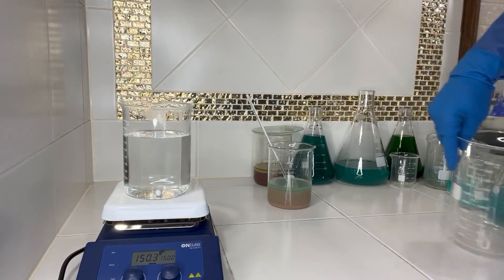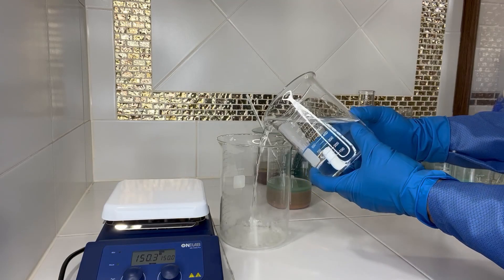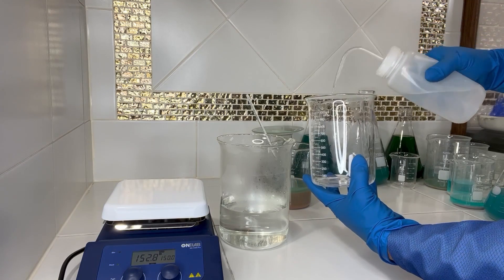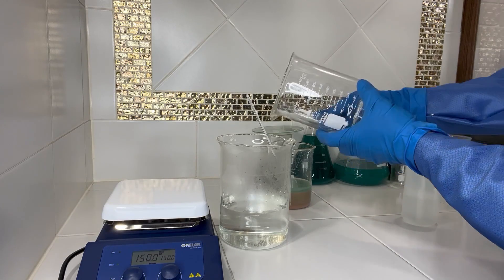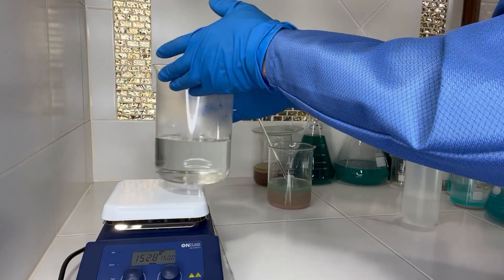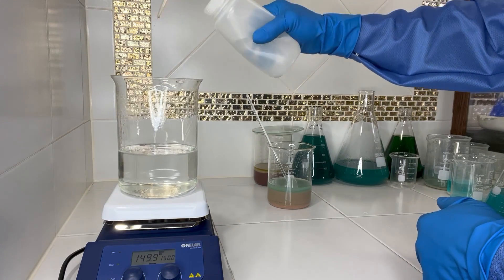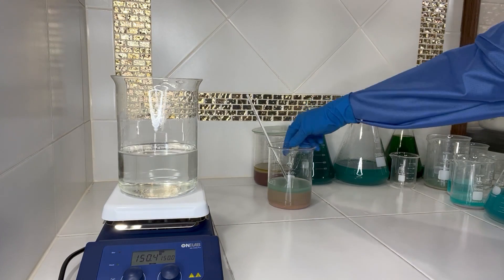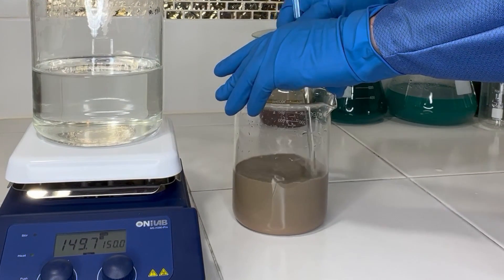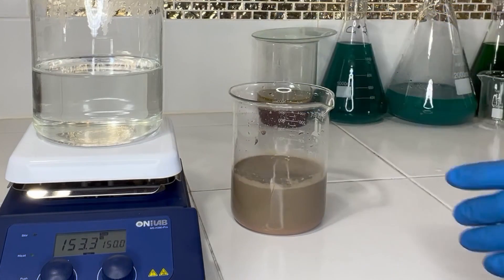So I'm just going to transfer this into a larger beaker, keeping our stir bar. Now remember, I'm keeping the hot plate on a little so that we don't have any of the sodium hydroxide crash out of solution. We'll give our slimes a good stir and go ahead and pour them into the solution.